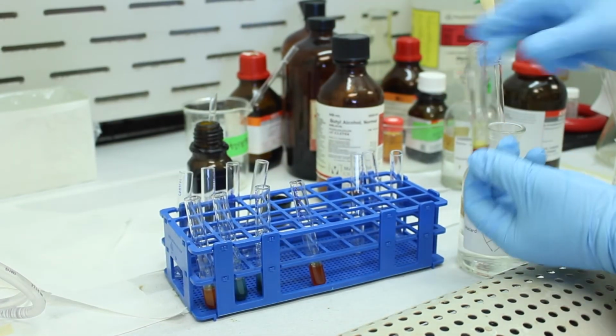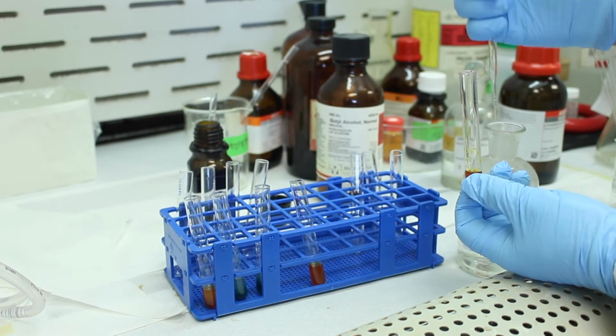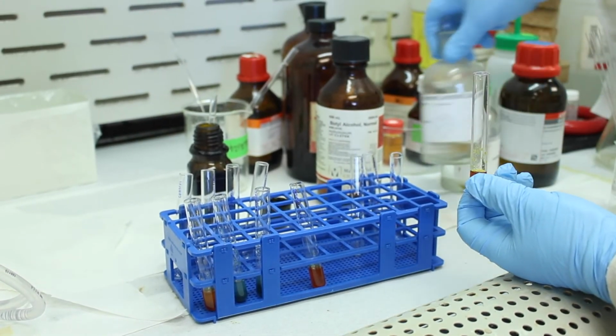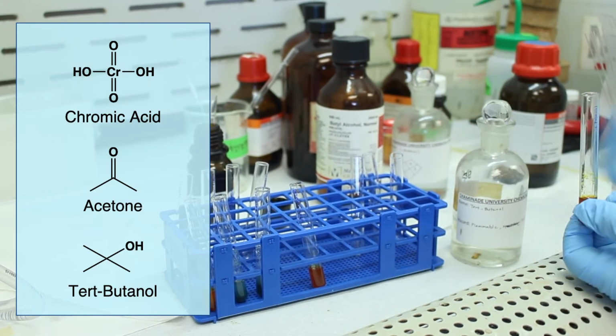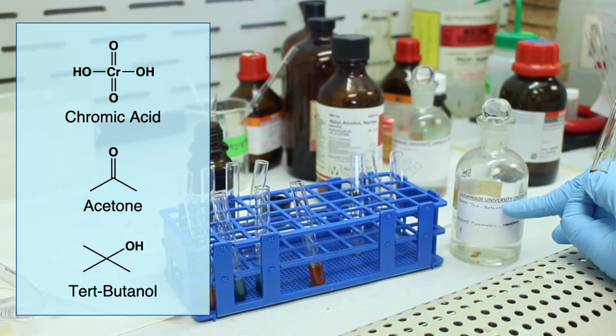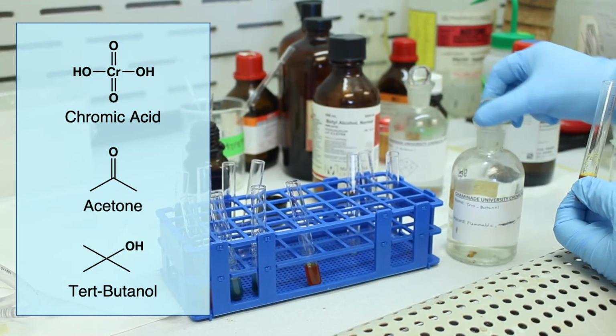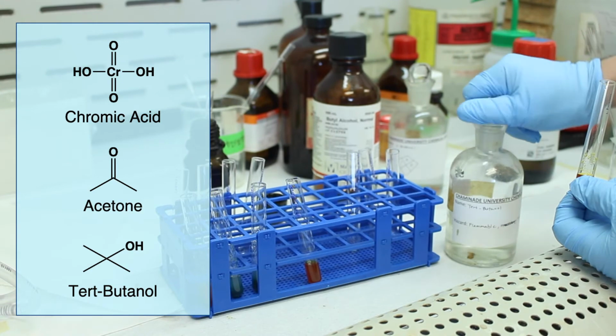All right, this test tube is a little bit different. This time, we're going to use the other isomer of butanol, tertiary butanol. So tert-butanol, this is a carbon with 3 methyls and 1 OH group. So there are no alpha hydrogens. So we predict that it will not be oxidizable.